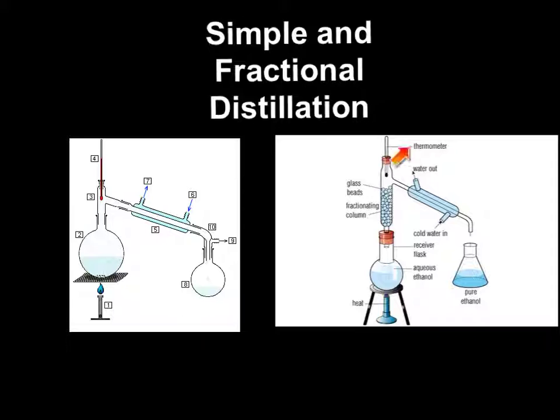Here we have our fractional distillation setup, which is pretty much the same. However, we have a fractional column, which allows us to have a more efficient separation of the two substances, and we'll go into detail later on in the presentation.